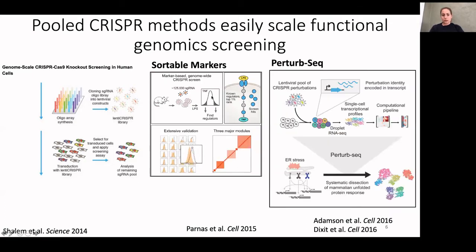And so the other options that have come out recently using these lenti-CRISPR methods are to combine with various transcriptomic approaches. So single cell transcriptomics allows you to more specifically combine the application of what a particular guide RNA is along with the single cell transcriptional profile for a given cell. And then you can use various computational approaches and again, some guessing and inferences to look at gene expression from what you can capture at the single cell level and try to understand more globally what pathways are upregulated or downregulated, et cetera, or how different genetic knockouts may or may not cluster together.